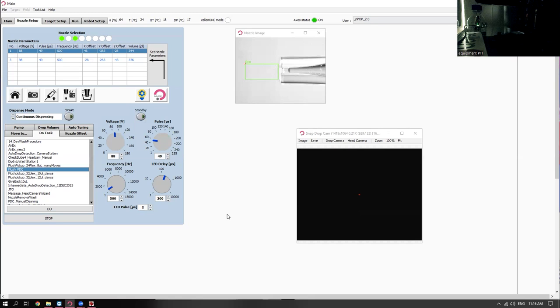What percentage of cells are one way versus the other? Are infected and not infected? There would be infected and uninfected, but within the infected ones, there is a huge range. They are essentially categorized into three stages: one is a ring stage, which is very tiny; then a trophozoite stage, which is slightly in the middle; and the last, the schizont stage, which is pretty big, almost equivalent to the RBC. What is this again? Malaria? Yeah. Wow. Okay. Plasmodium parasite.